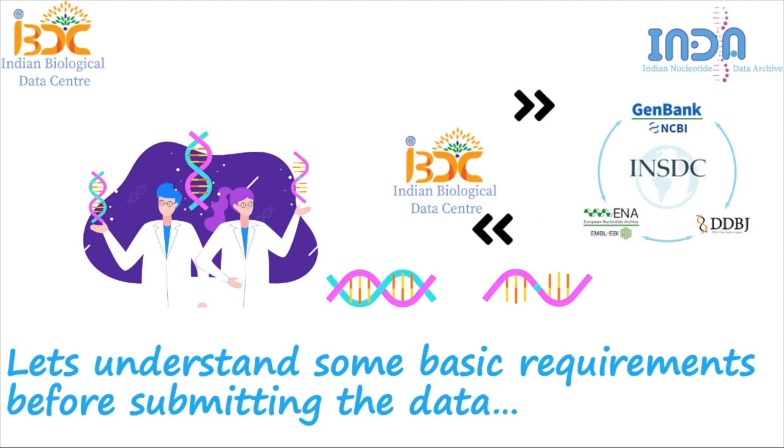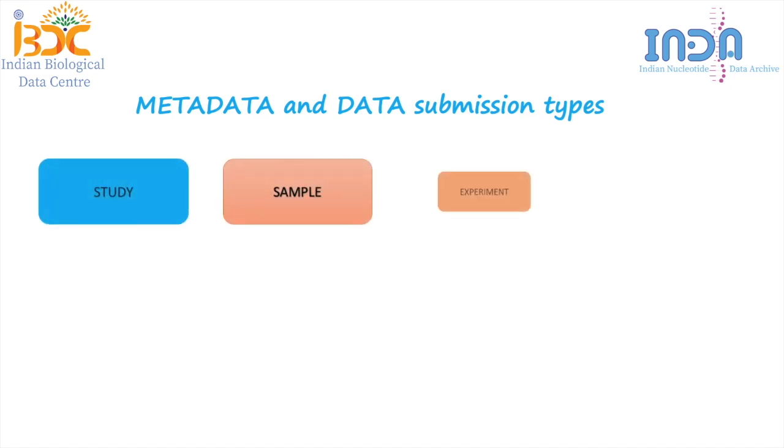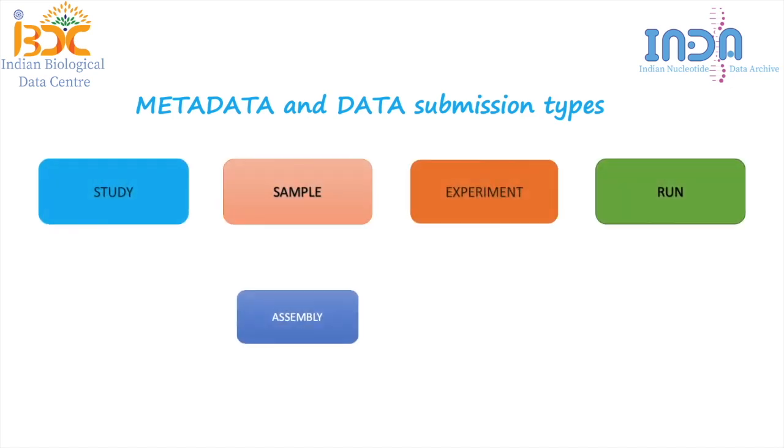In general, the data submission to INDA is as per the formats accepted by the International Nucleotide Sequence Data Consortium or INSDC. Different type of nucleotide datasets need to be appended with suitable metadata to ensure discoverability and appropriate interpretation. Thus, all submissions must include various metadata groups such as study, sample, experiment, run, assembly, and annotated sequences.